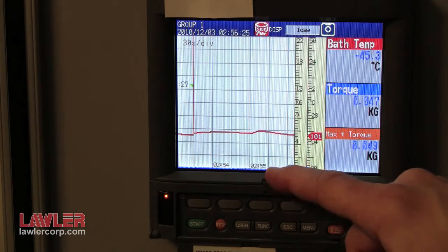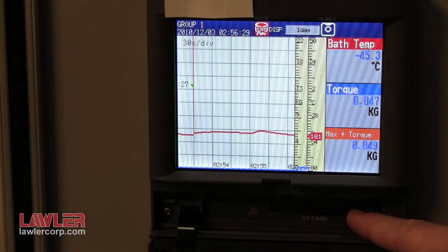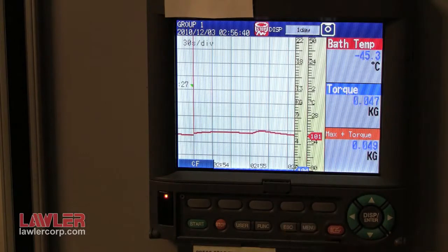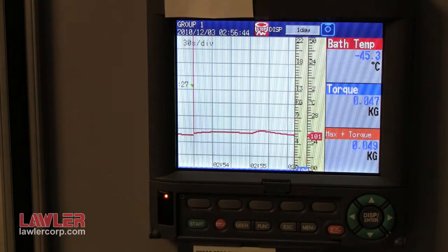The actual memory is stored behind the second door. It is a compact flash memory card that can be removed. Before pressing the button to remove it, press the function button, then press function and media eject, and then compact flash, so that the media can be safely removed.